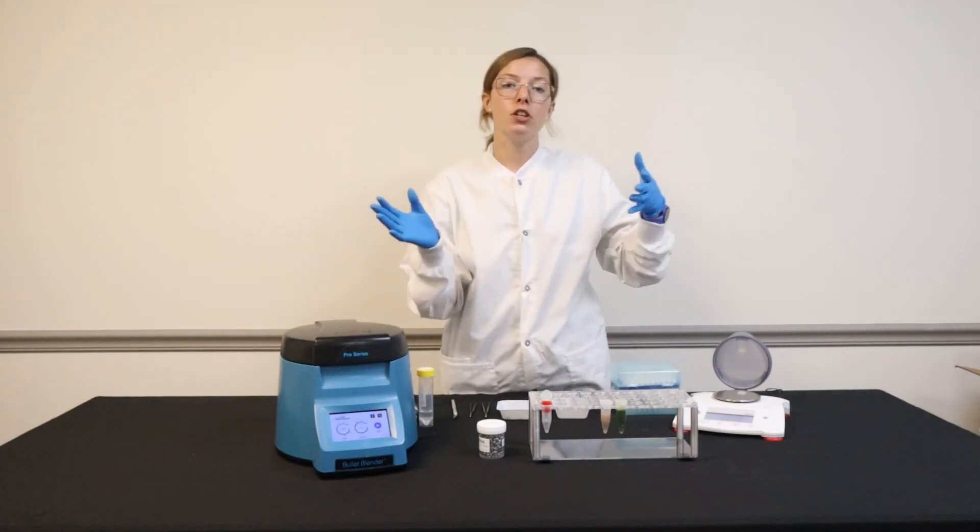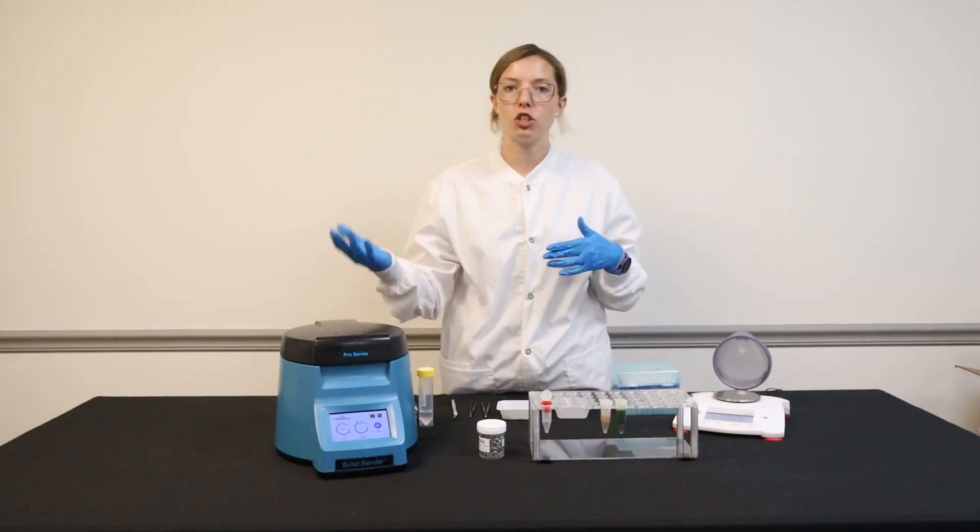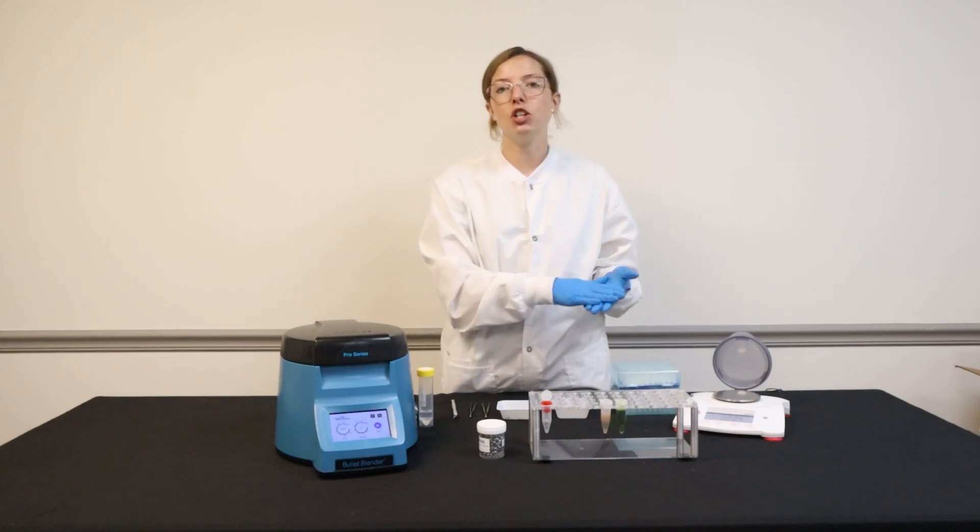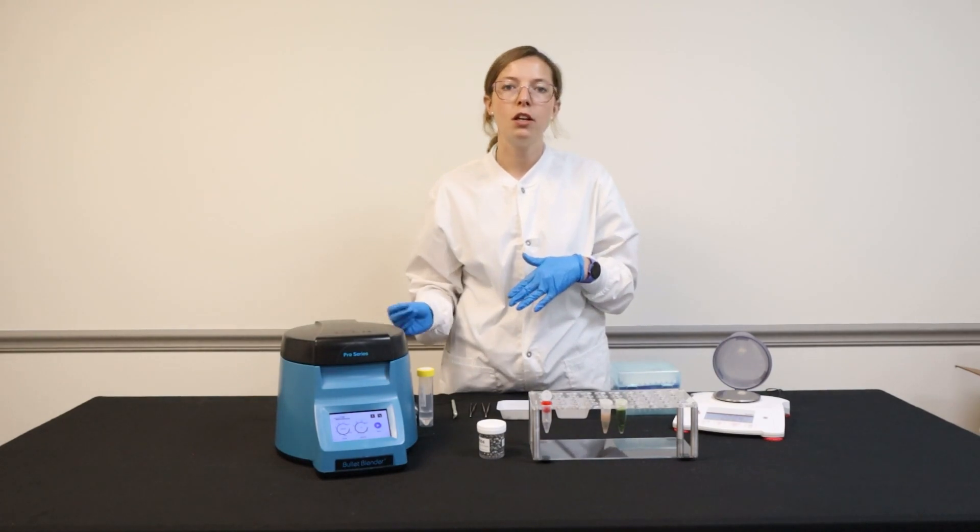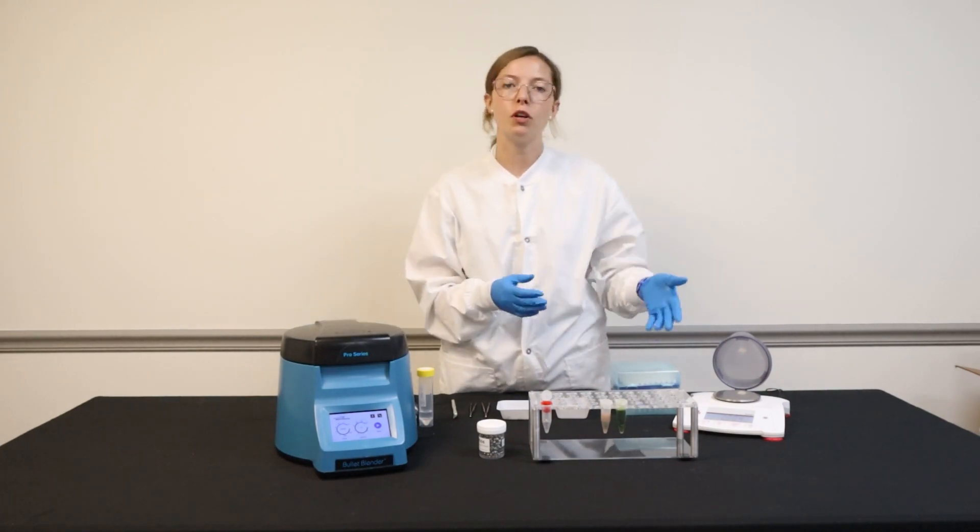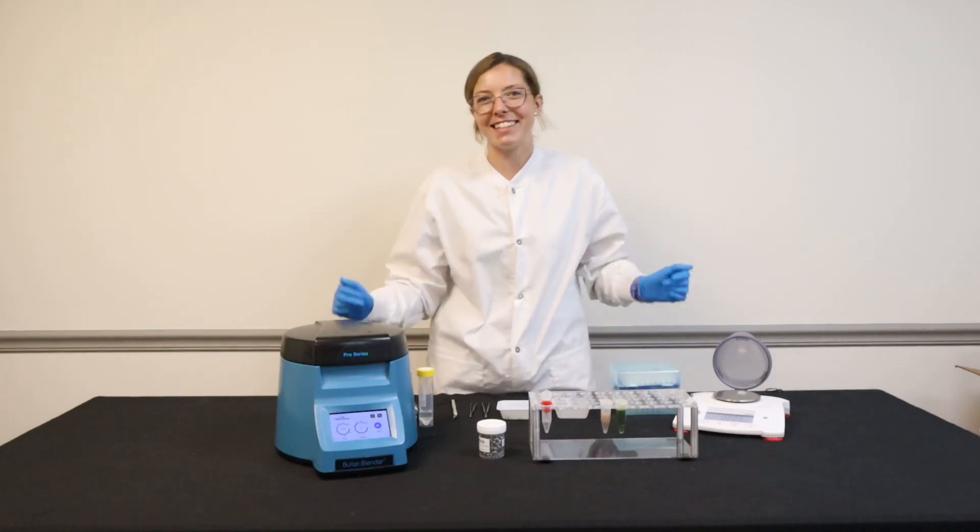Depending on your downstream application, you can either centrifuge the samples now to extract the clarified supernatant, or you can just extract the whole homogenate and place it in a clean tube. You can store it in the freezer or you can move directly to the next stage of your protocol. It's that easy.